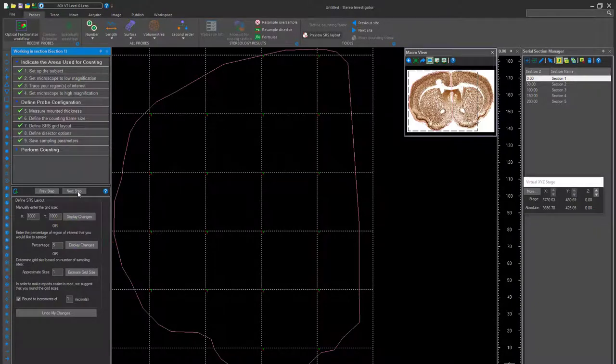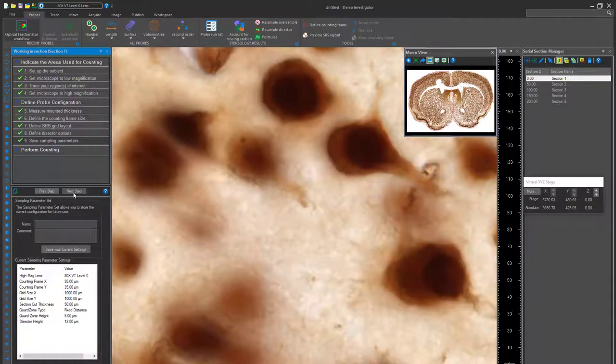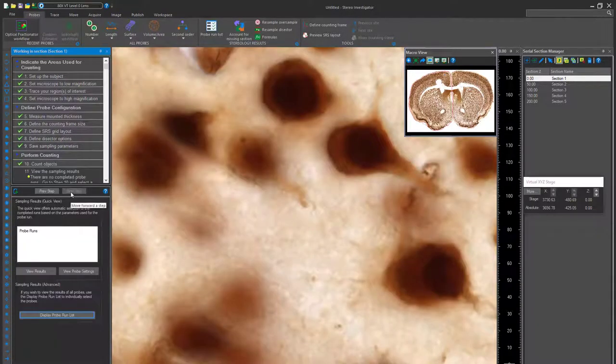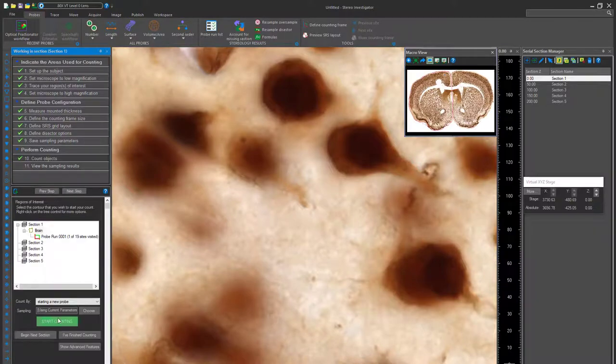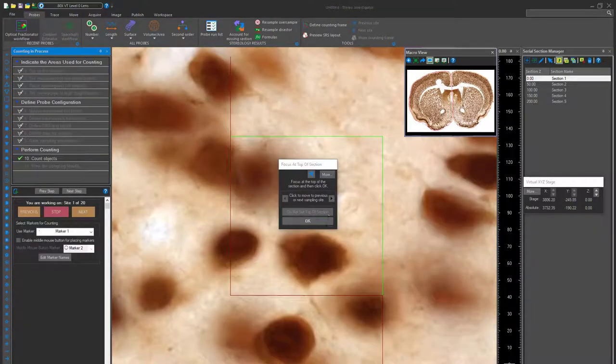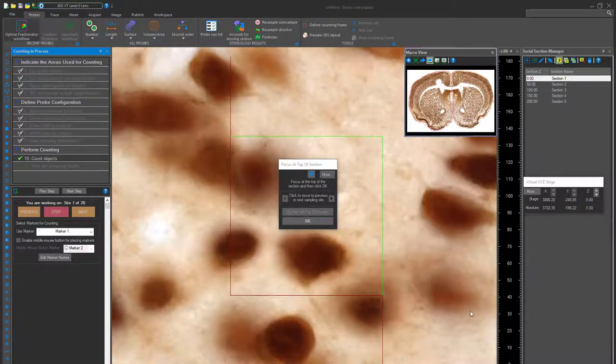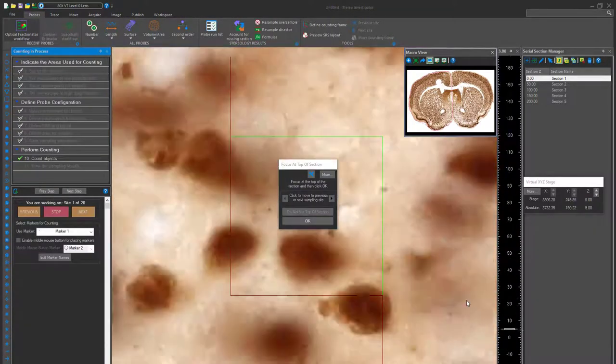At this point, you will have connected your microscope, contoured the areas of interest, and configured the dissector size and grid layout. The only step left is to count the cells.